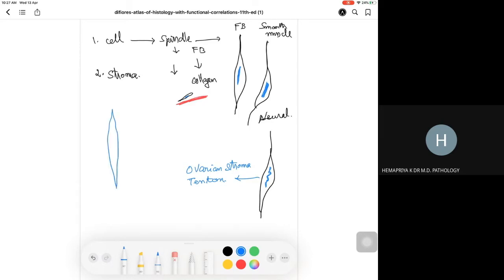What is this cell? Is Veda there? Veda. Yes, sir. So, what do you think?